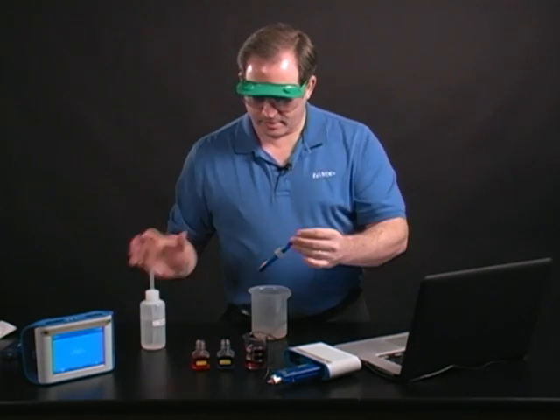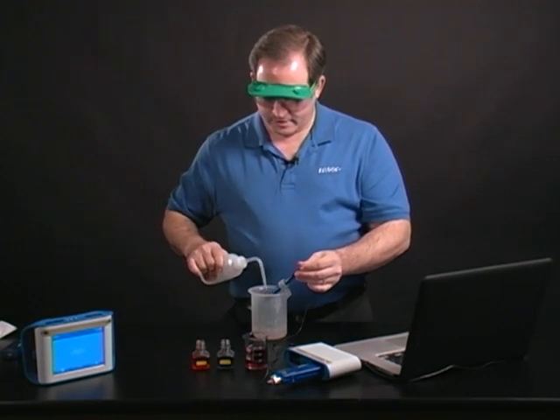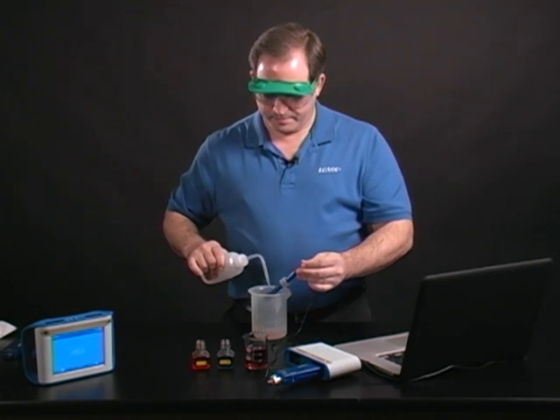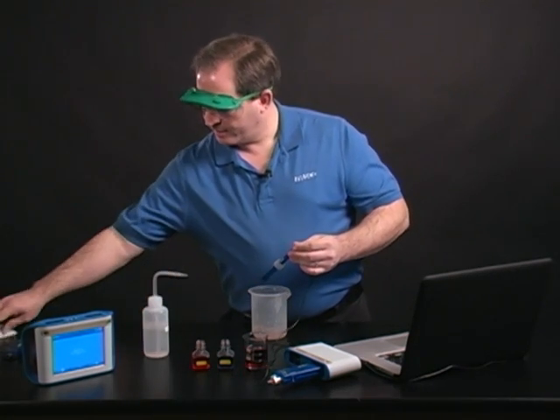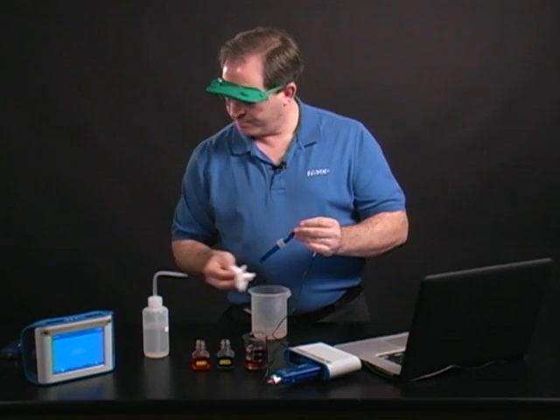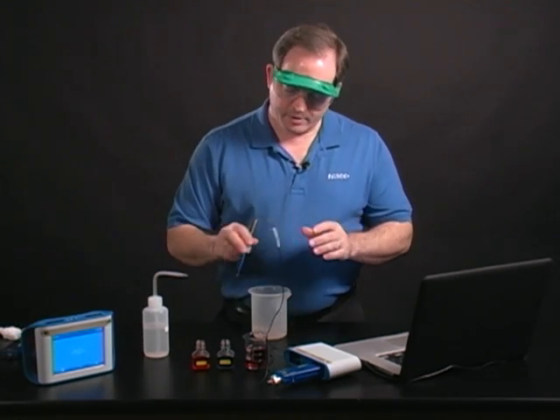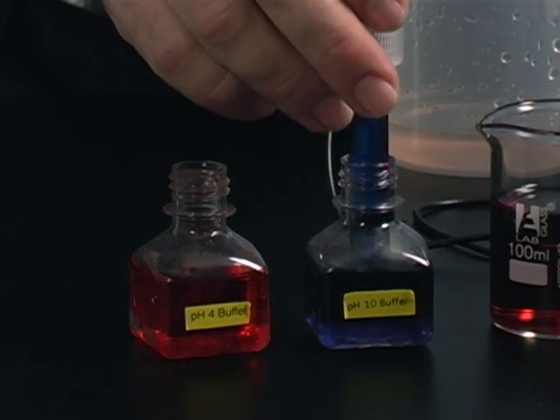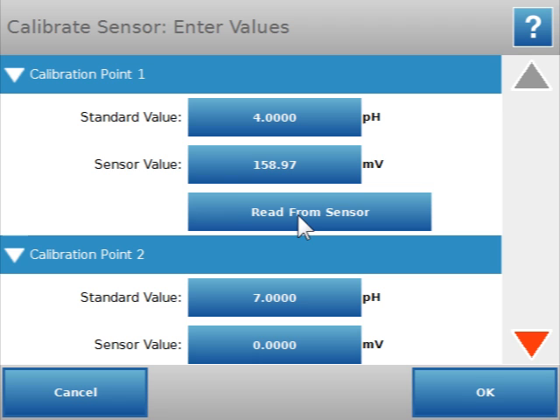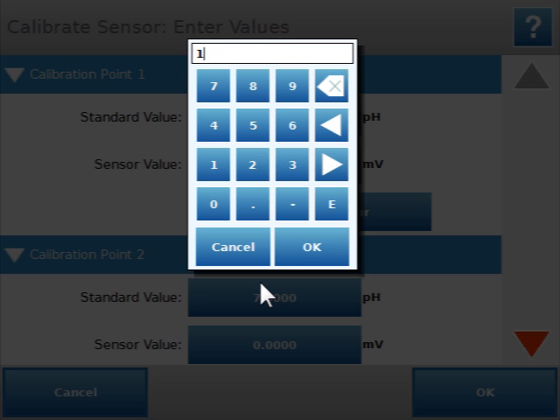Then I'll take that out and rinse it off thoroughly so I'm not mixing my buffers. I'll set that aside and blot once more. Now I'm going to put that in the pH 10 buffer. What I need to do on the screen is change 7 to 10 and say OK.